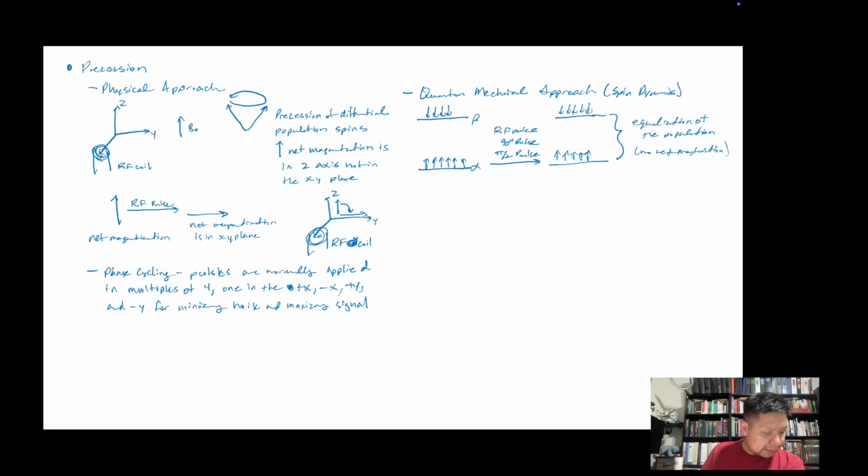And then let's do, if we had, for example, a 180 degree pulse, alpha state, beta state. Oops, I set that backwards. This time, let's say we have 4 protons in the beta state and 6 protons in the alpha state, just like before. And again, I'm doing this very cartoony drawing of the different spin states to show how the angle of the pulse dictates our net magnetization.